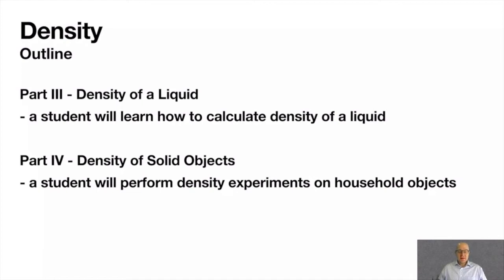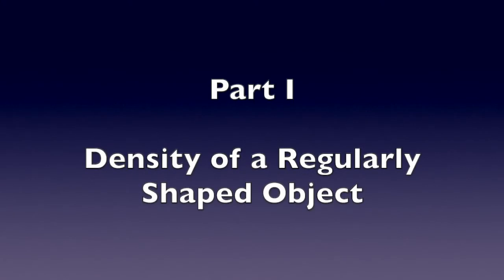Part 4, density of solid objects. Now, this is something you're going to do at home. You're going to do basically a test with water to compare densities of everyday household objects to water. Very cool, very easy.